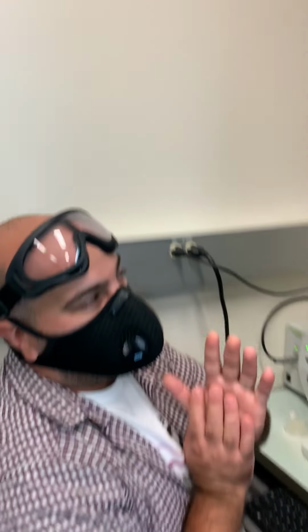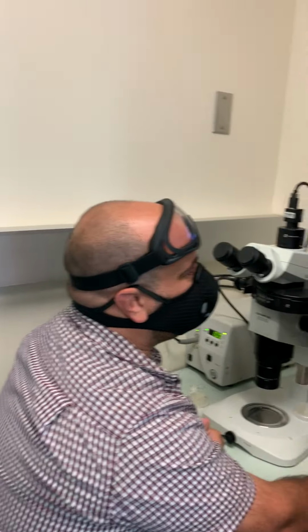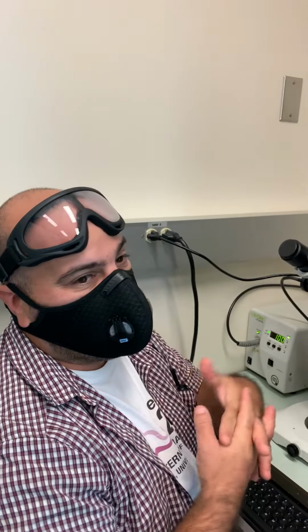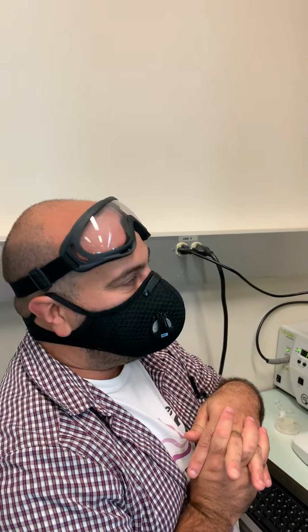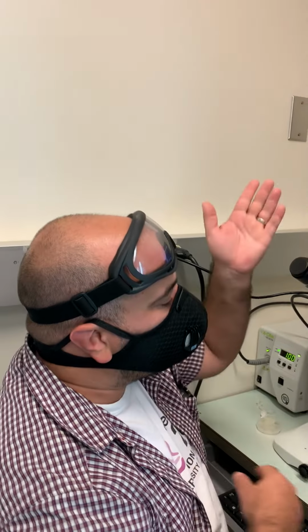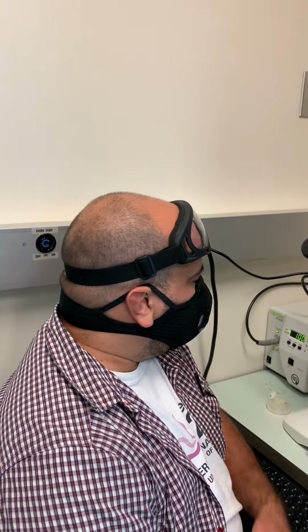Also, when you're starting, it's okay if you just go down one side. So if you just wanna do the one side of the body and then the angles, that's fine. We're gonna get that correlation, and we can go back and get the opposite side later if you want, right? Once we have the frames, we know what frames we're going after, so we can always go back and double check the data. So hopefully that helped you.